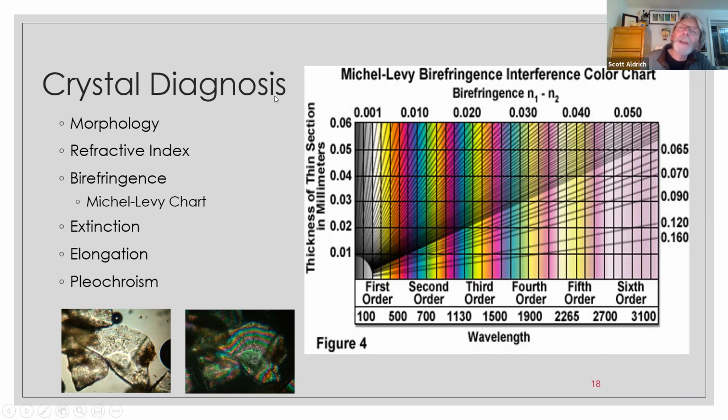This chart that looks like a rainbow, it looks like gas on a mud puddle, frankly. It looks like interference fringes, and that's pretty much what it is. It's showing you what's called the retardation of the light rays from each other as they pass through material. And the greater the difference in refractive index, the thicker the material, the more pronounced these colors will be. And I can use those to my advantage in preparing slides for optical art.